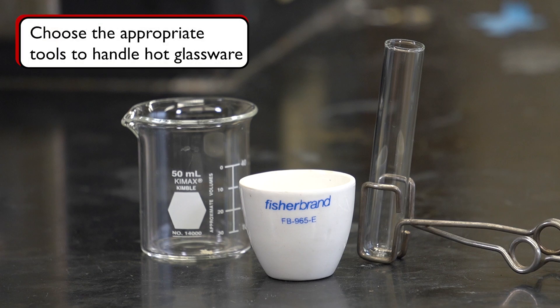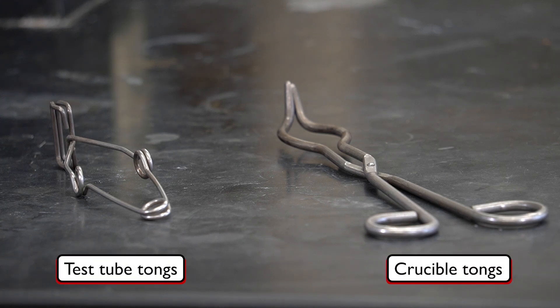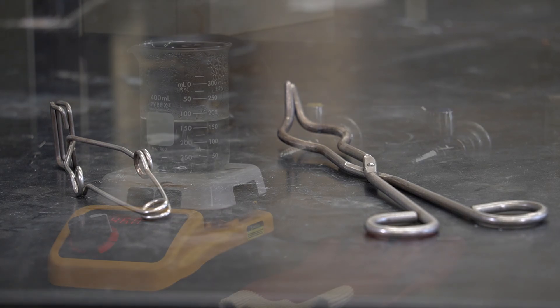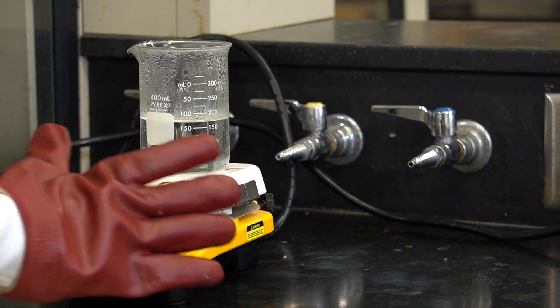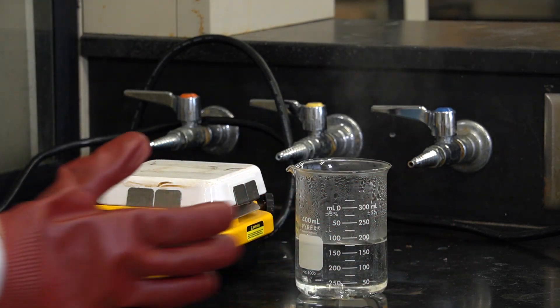The second rule in handling hot glassware is to always choose the appropriate tools. When dealing with lightweight samples like test tubes and crucibles, your lab will have a toolbox of tongs at your disposal — think of them as the lab's version of barbecue tongs. These tools let us handle hot equipment with ease, keeping our hands safe and providing a precise grip. For handling large samples like hefty beakers, insulated gloves are your best bet, providing the extra protection needed to handle large hot glassware safely.